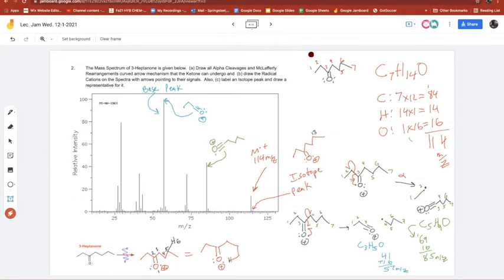And I'll number it. I got the 1, 2, 3, 4, 5, 6. But I can't remember, I still have another methyl off of 5. So let me number those, maybe the green ones. So this is 1, 2, 3, 4, 5, 6, 7. So yeah. All right, we're ready to go.